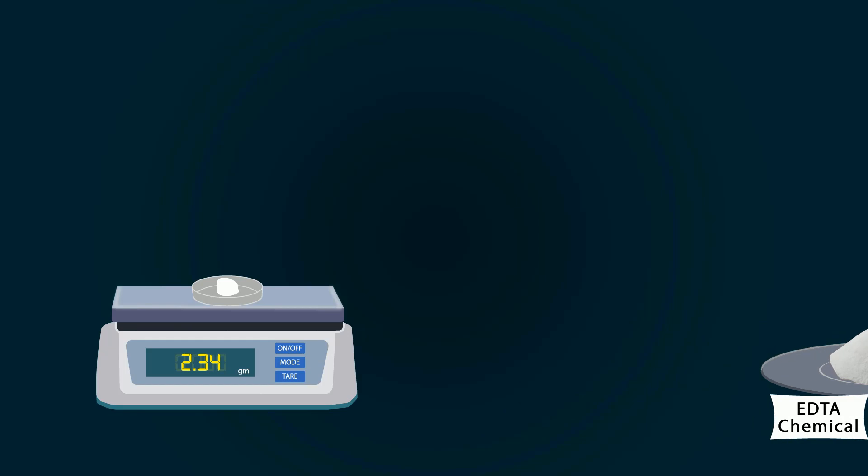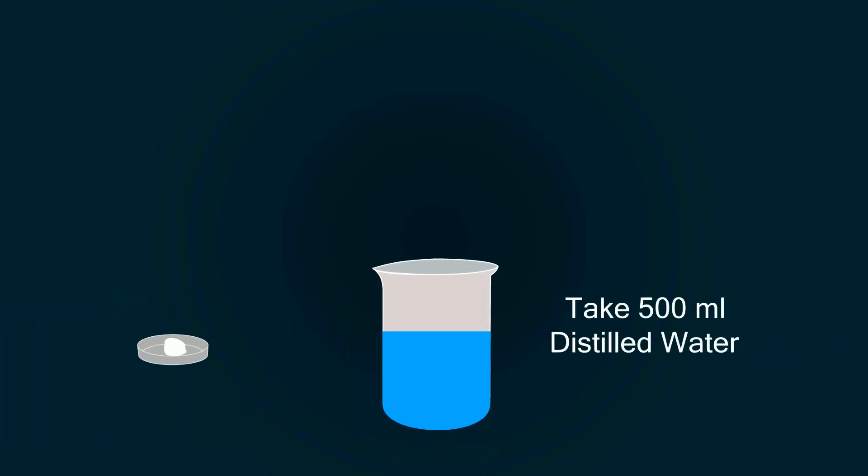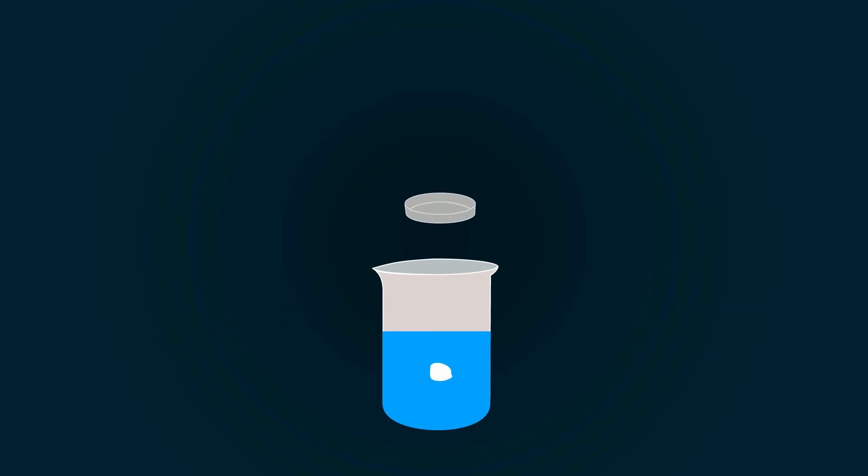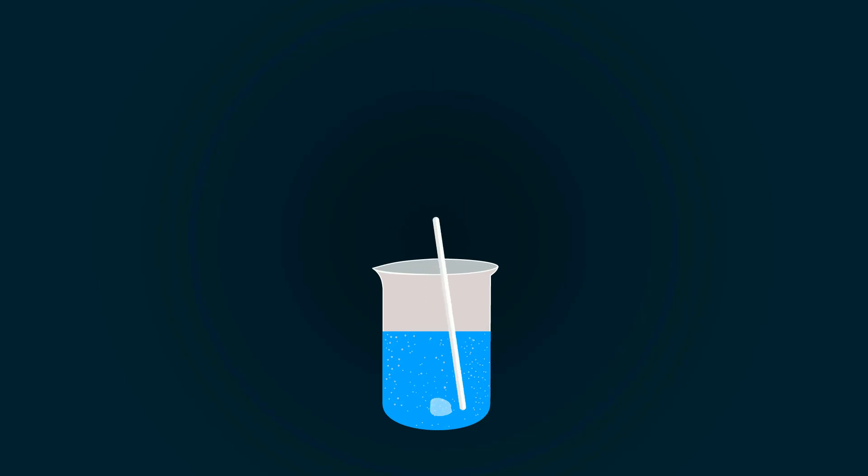Now take some distilled water in a beaker up to 500 ml and put the EDTA chemical into it. Start mixing it with the help of a spatula to make a homogeneous mixture.